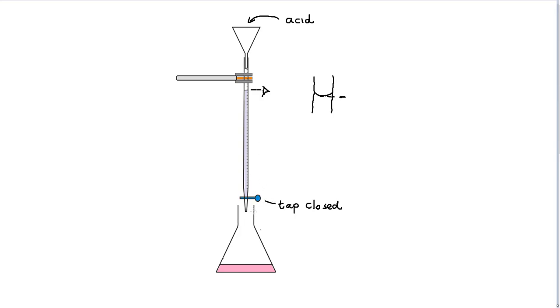The next step is to open the tap and very carefully allow the acid to mix with alkali and indicator. We're going to open the tap and carefully the acid will pass into the alkali, and we're going to gently swirl the conical flask around so that the acid and alkali are mixing properly. We're going to do this very slowly.